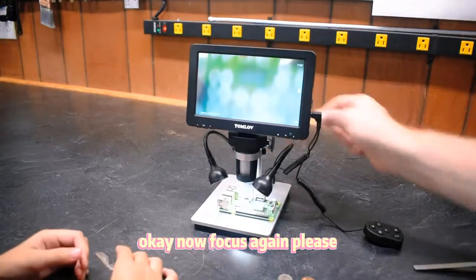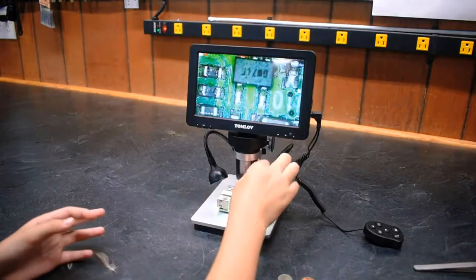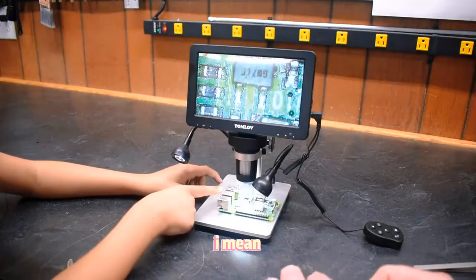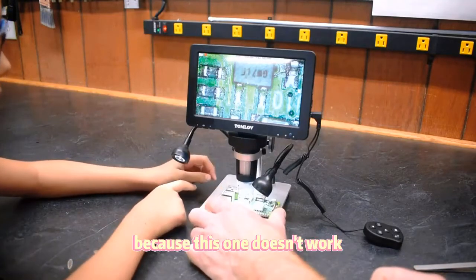Okay, now focus again please. Hold on, hold up. Why do you have a smiley face? I mean a frowny face. I've got a frowny face on that because this one doesn't work.